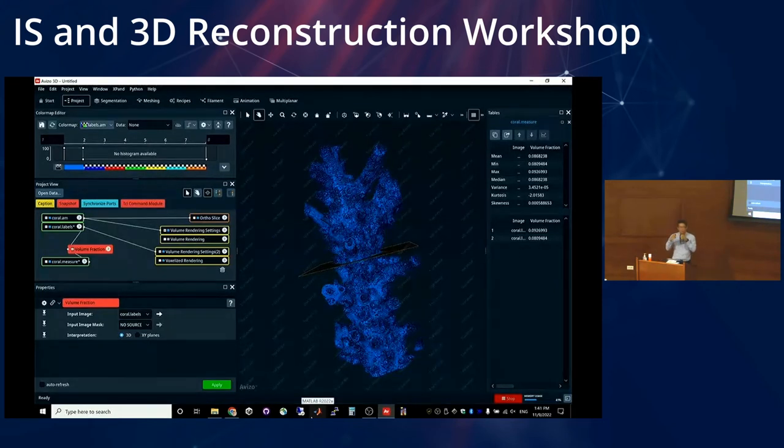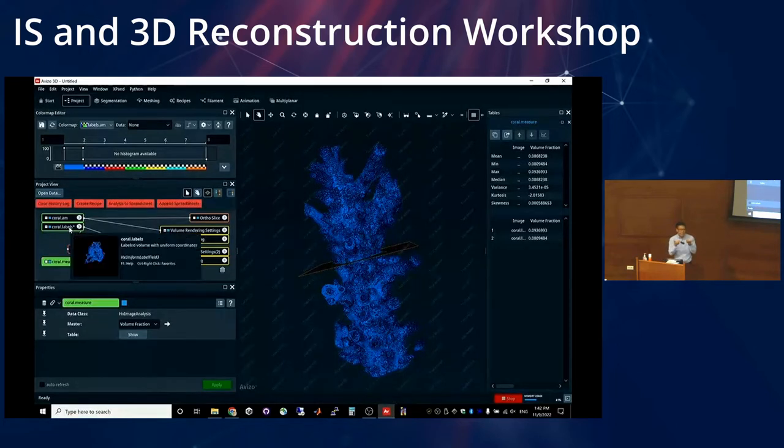Any questions so far? Again, this is a simple data set. But it's beautiful, right? I guess it depends on the materials that you're scanning. You can get lucky, right? And that segmentation just means thresholding. So thresholding works really well, as you can imagine, for data sets where the materials are distinctly separated in terms of the intensity values, okay?